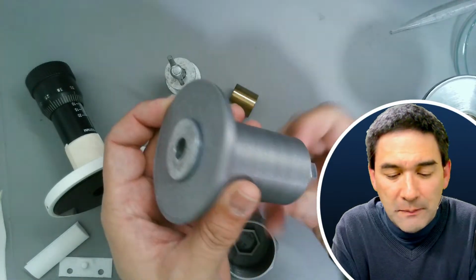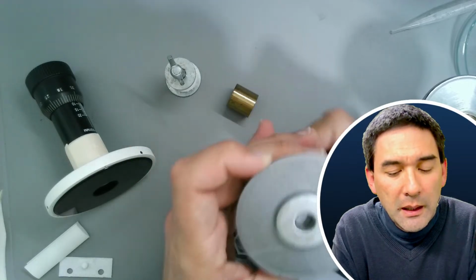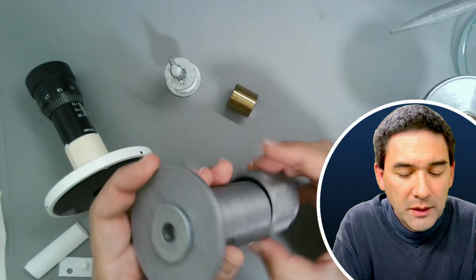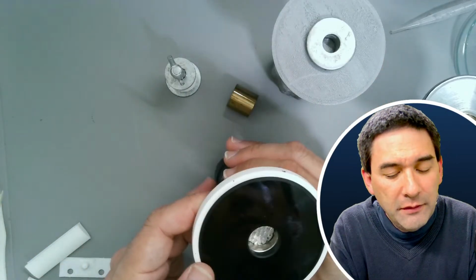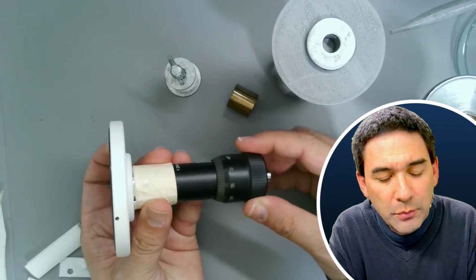This also works. A little bit more of a proof of concept, really, but both of them have a problem, and I'm going to show you another one which has the same problem. And this is actually the highest quality microtome that I have. It turns very smoothly here.